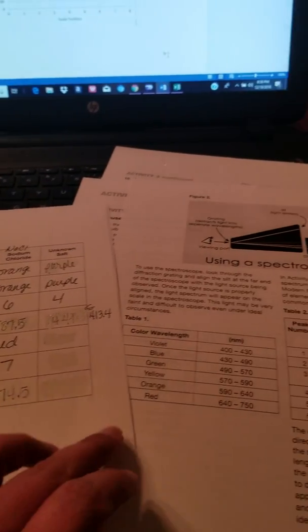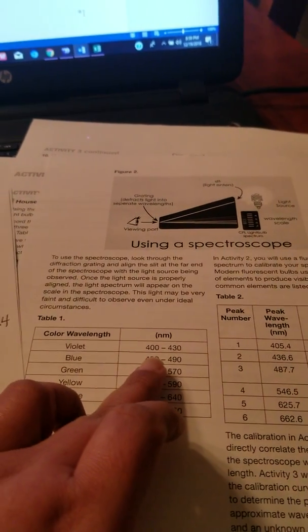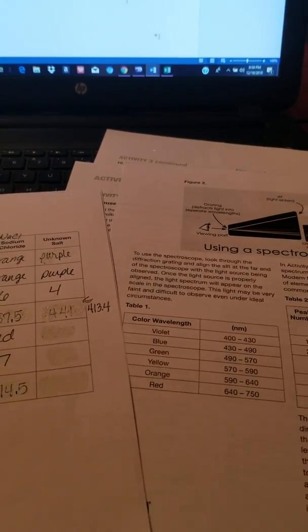And then I calculated those, I put those numbers into that particular equation, and that's how I got these wavelengths that I can actually use to see if they were calibrated. For instance with purple, when I calculated, I put in the line number of 4 that I had in there at 413, and we see over here how violet it is at 400 to 430 nanometers.